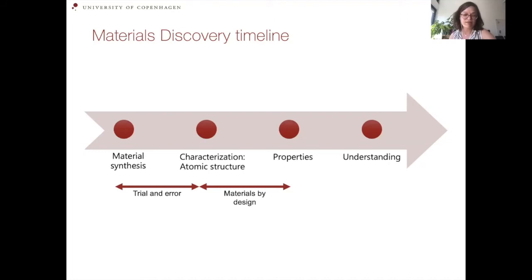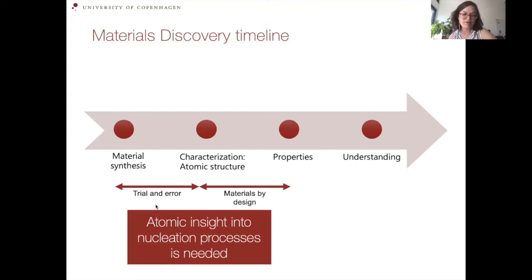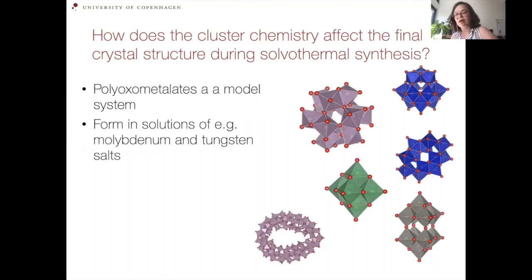So this is something we would like to change, from trial and error to maybe having an idea of synthesis by design. To do this, we need atomic insight into these nucleation processes. In situ PDF can help us with this, because the idea of in situ total scattering, compared to in situ powder diffraction, for example, is that we can follow the structural changes also before we have long range order, so before we have anything crystalline. And I'll show a couple of examples of how this can be used.